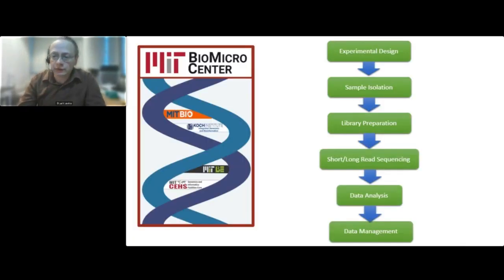So I'm the director of the MIT BioMicro Center. We're an integrated genomics and bioinformatics core facility here at MIT. We work with labs across the campus, handling things everywhere from experimental design through library prep, sequencing, analysis, and even data management.